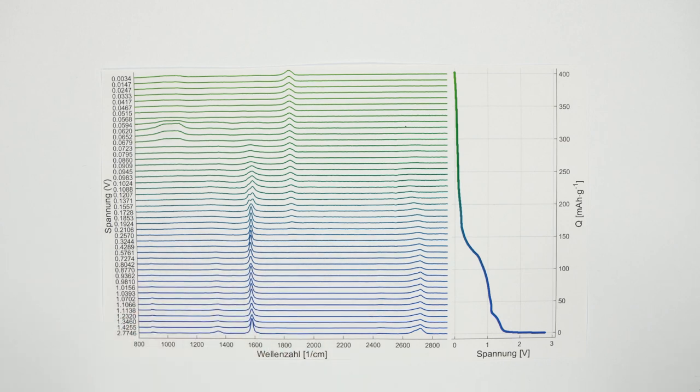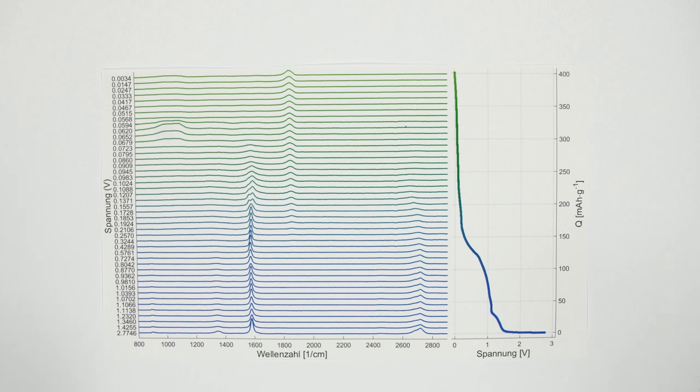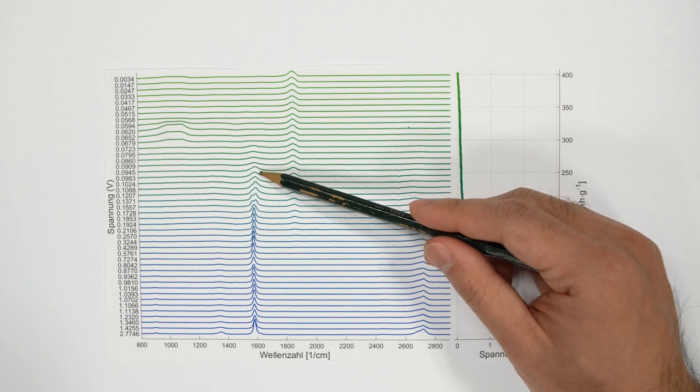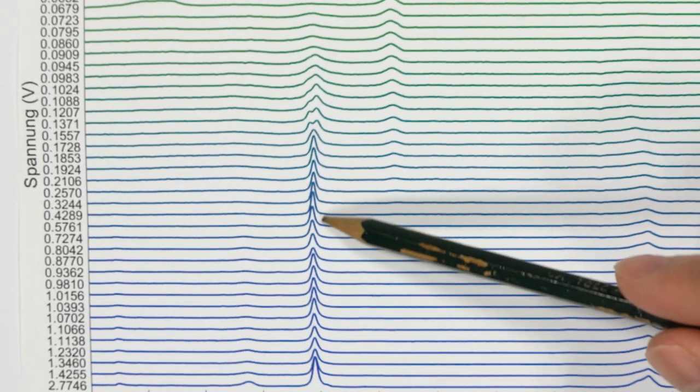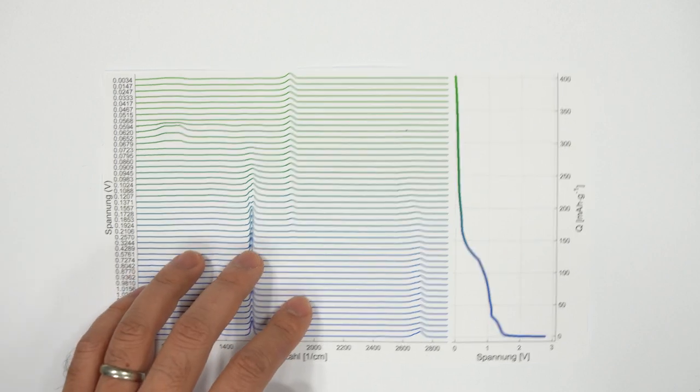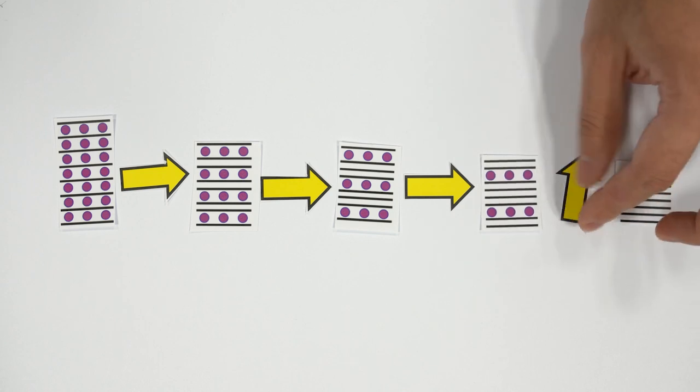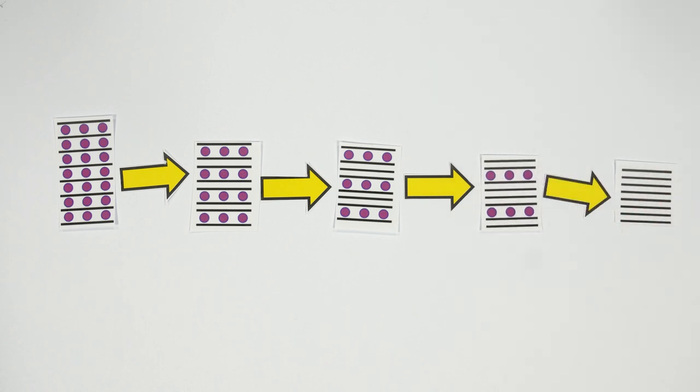This measurement was done by S. Jovanovic from IEK9 Research Center in Jülich, Germany. As the voltage goes down, the charge taken increases until the voltage ultimately drops to zero. On the left, you can follow the Raman spectral change over time as the voltage decreases. At first, the G-band is broad and split, but slowly it shifts, converges, and finally forms a sharp and strong Raman peak. Such crucial details are only accessible with a well-calibrated Raman device. Following the spectral change, we can observe that after discharge, the graphite structure has been fully recovered.